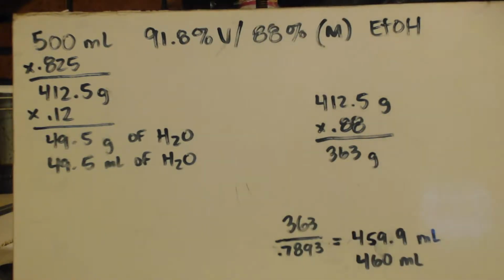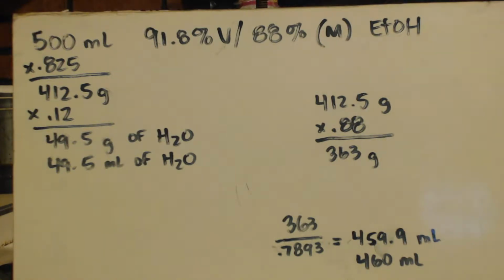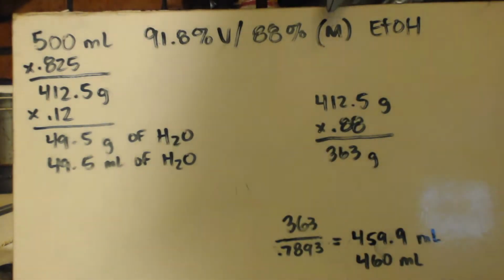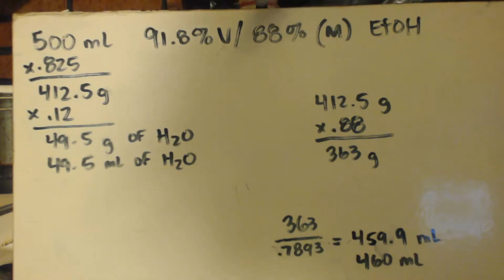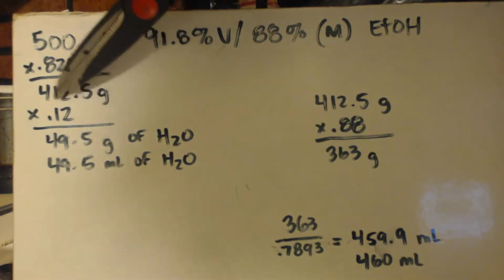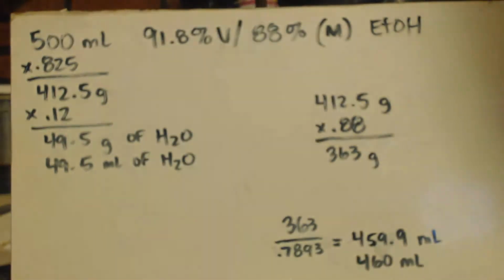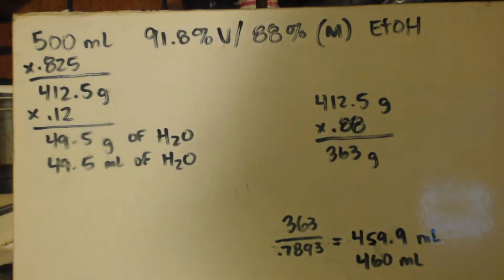Because if you add 500 milliliters of ethanol and 500 milliliters of water together, you do not get 1,000 milliliters of mixture. You would get a little bit less, okay? So you can't use volume, you've got to use mass. Now we have 88% ethanol, so that means we have 12% water. So I multiplied that by 0.12 and I got 49.5 grams of water. Now the density of water is 1, so 49.5 grams equals 49.5 milliliters of water, right?